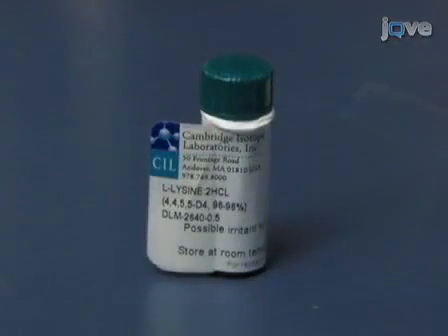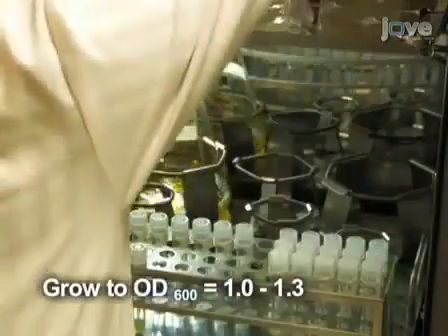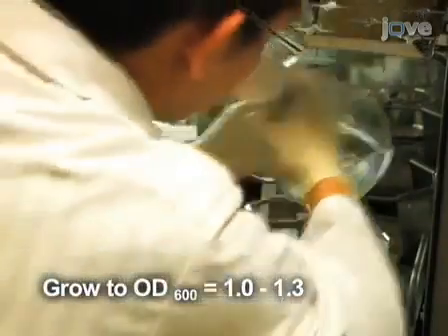In this procedure, the bait strain contains normal amino acids while the SILAC control strain contains heavy isotopic lysine and arginine. To get started, first grow 1 liter each of the bait strain and the control strain separately to the values shown on your screen.